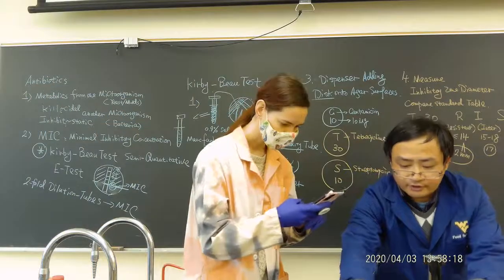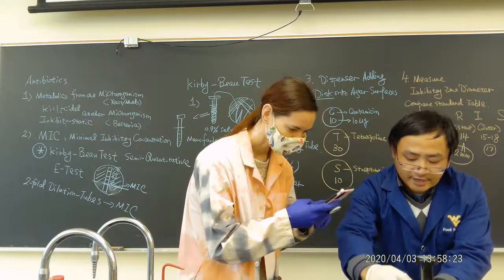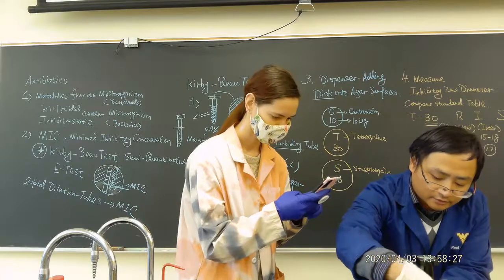This is a disc, very clear. Okay, this is a disc. We're going to have to add in. So when we add in, we put it there. Put one there. Put another one there.